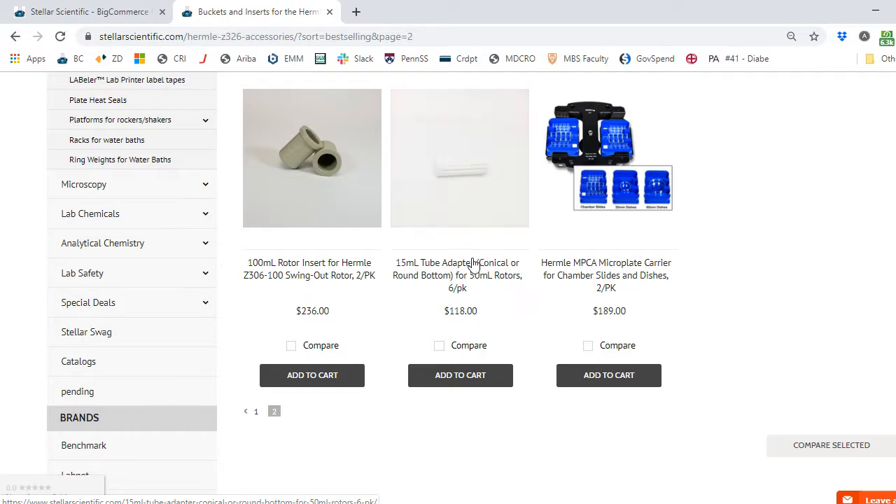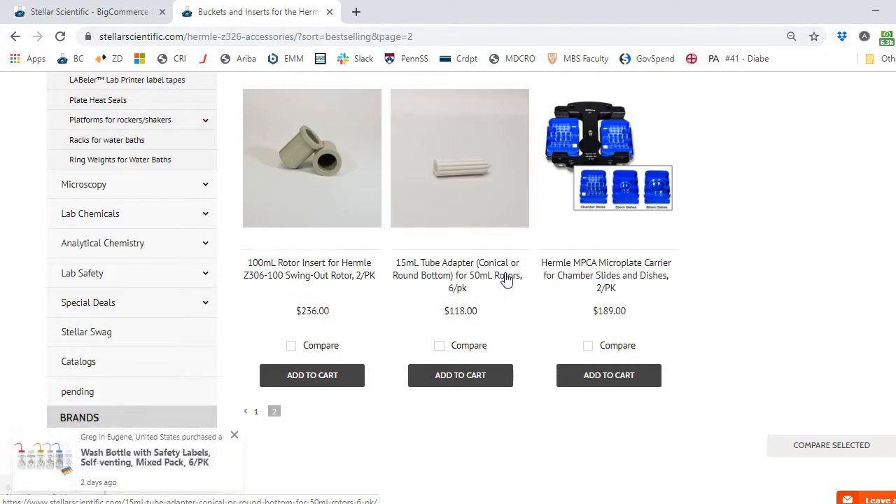In totality, I've purchased several things: the centrifuge, the Z326K; the swing-out rotor that came with the buckets, plus inserts for my 15 mL and 50 mL tubes; and then the high-speed fixed angle rotor, with a 15 mL tube adapter to reduce the cavity so I can spin 15 mL tubes in a refrigerated centrifuge at speeds exceeding 10,000 times G. And that's how you use the Stellar Scientific website to shop for your own Hermle centrifuge.